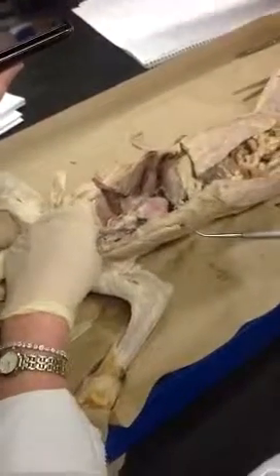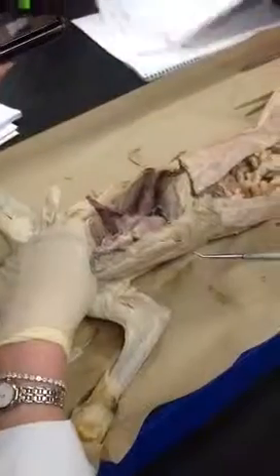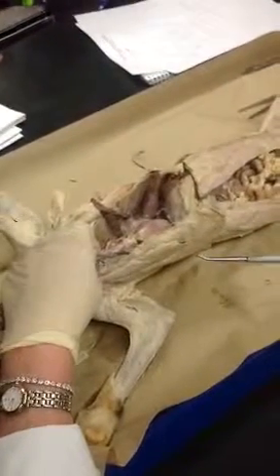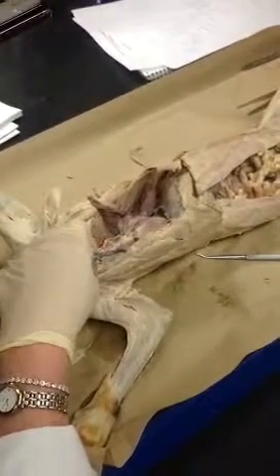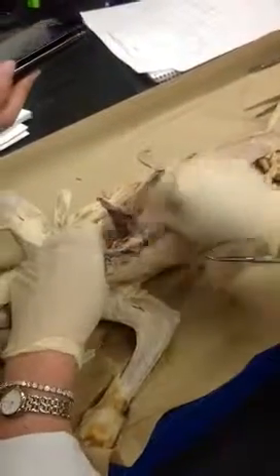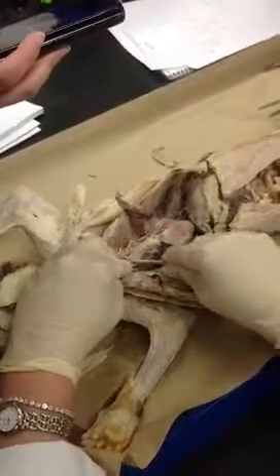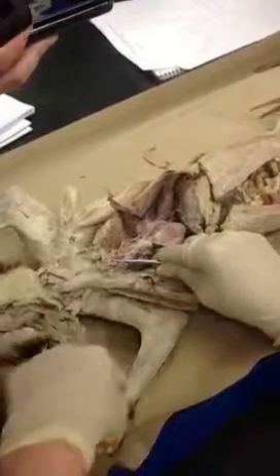Turn 2 pages. The map. There you go. Okay, there we go. There's the left subclavian. There's the brachiocephalic trunk, which branches into the right subclavian and the right common carotid. So here's your brachiocephalic trunk. There's your right common carotid. There's your right subclavian. Okay, and we're going to the cat's right.